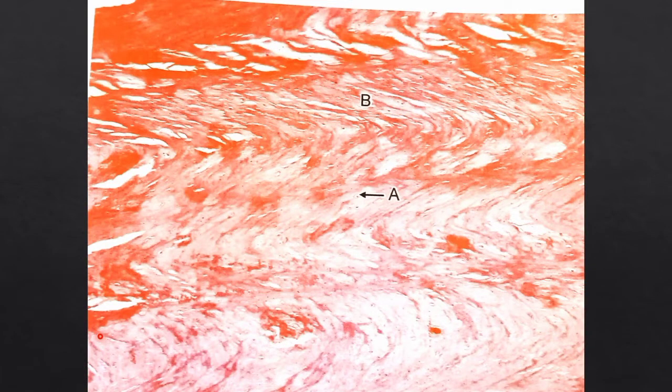Coming to the white fibrous cartilage, this is how we can identify it in the microscope. The entire fibrous part you can identify. Occasionally here you can see one chondrocyte, and the chondrocytes are arranged in rows, means one by one. That is the identification of white fibrous cartilage.